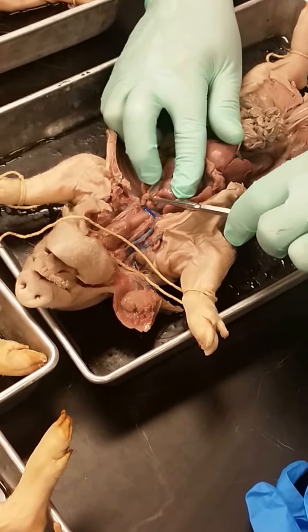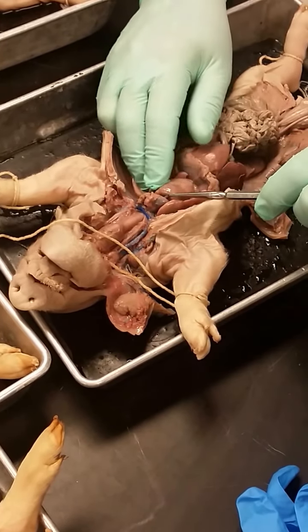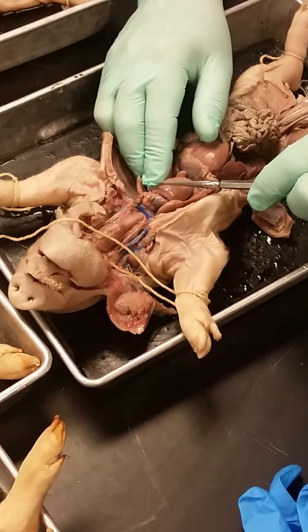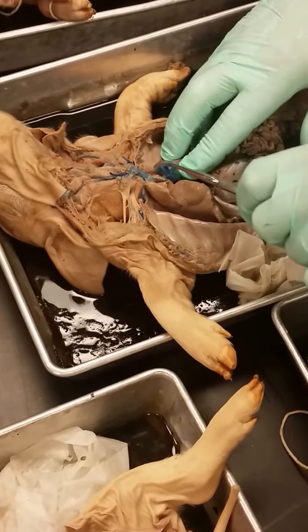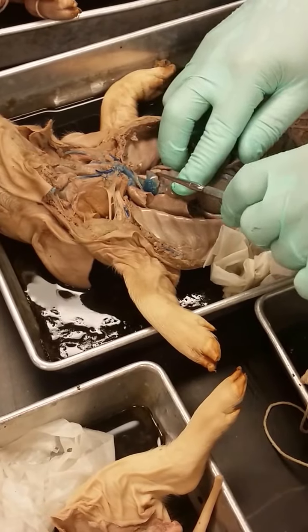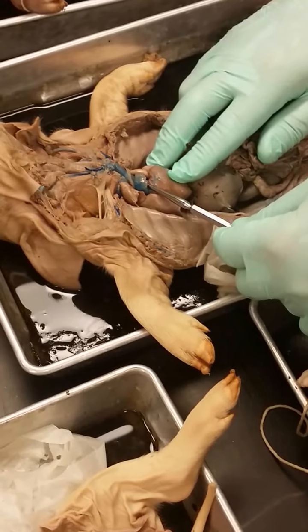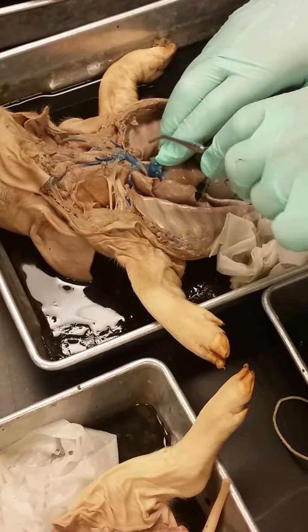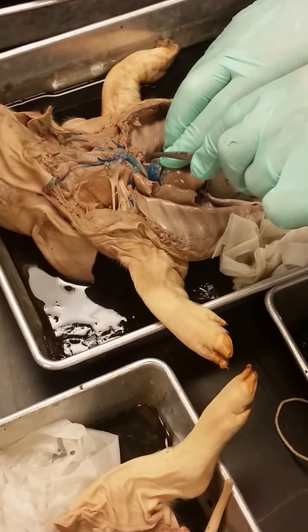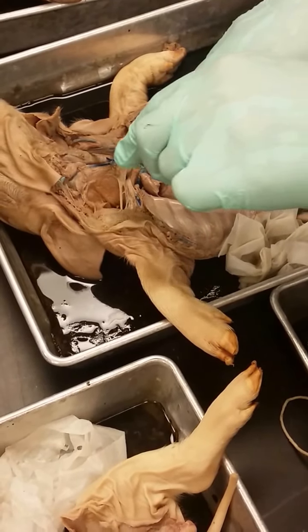And then if I pull this away, even though you're probably not going to be able to see this very well, what is that vessel right there? No, it's not the aorta, that's the pulmonary trunk. And here's the pulmonary trunk, and on this one, you can see the aorta. So this has been dissected a little bit better in terms of being able to see the heart. And then right here, you see the brachiocephalic coming up, and then that branches into the common carotids that go up on either side.